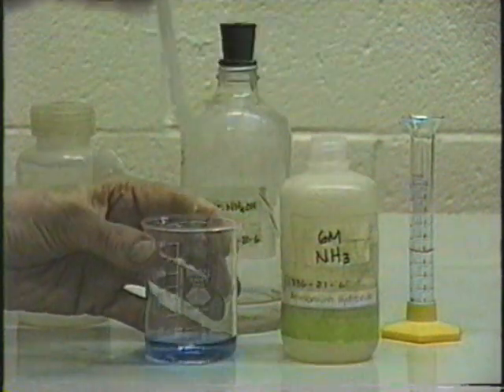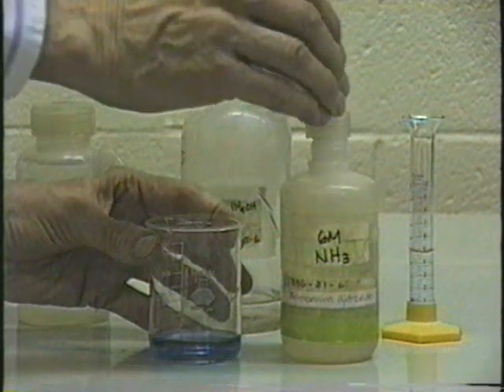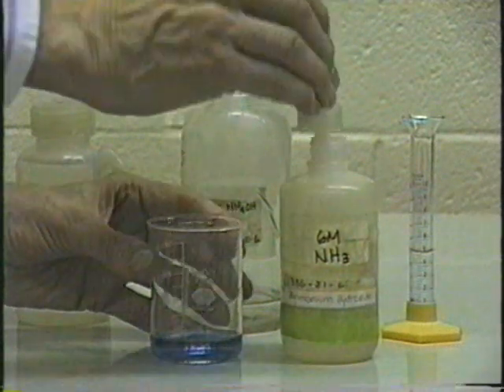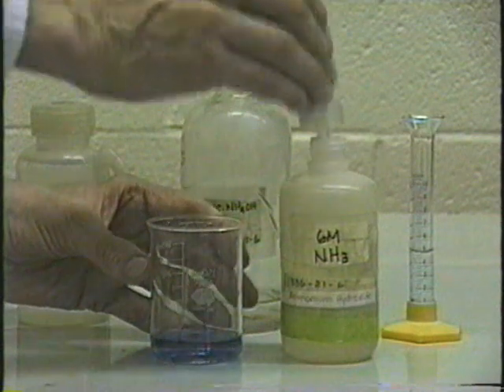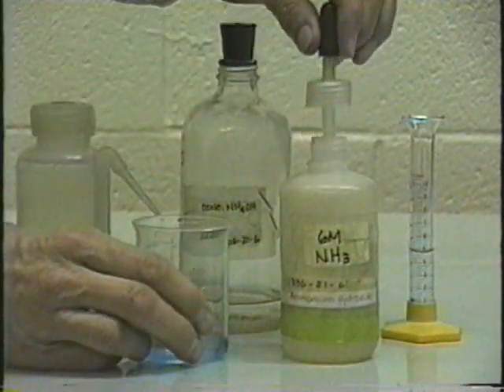We can add that. As you see, as you add it, you get this darkening color here, but that has to be a permanent color. Now we'll start swirling it here.